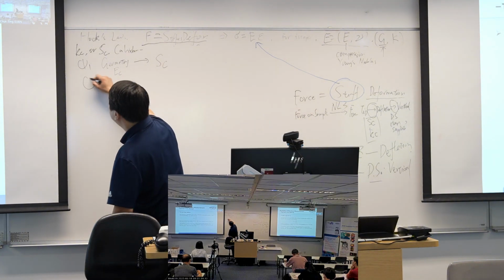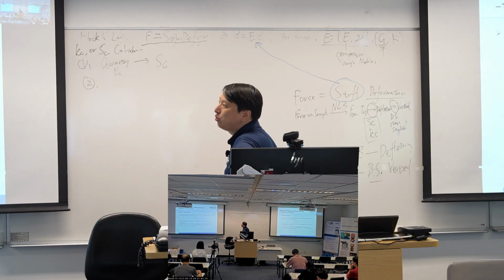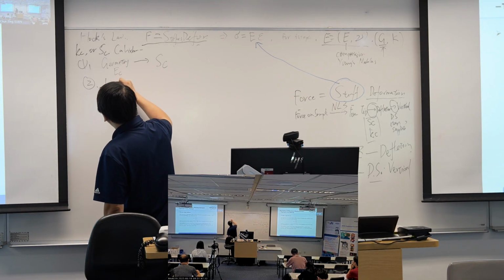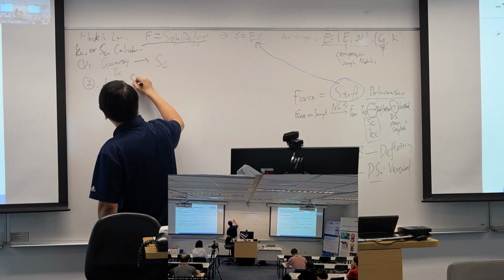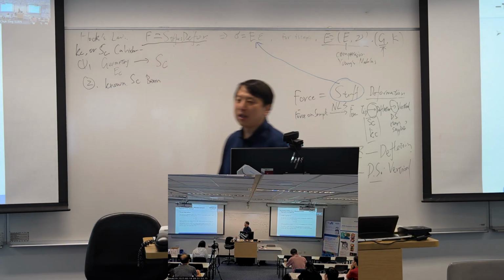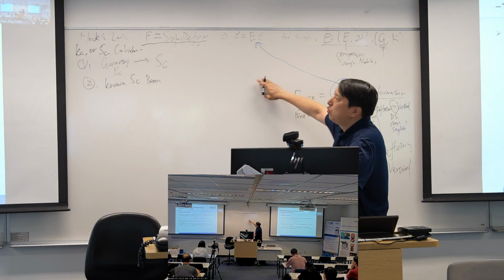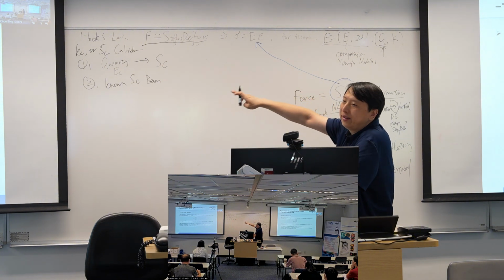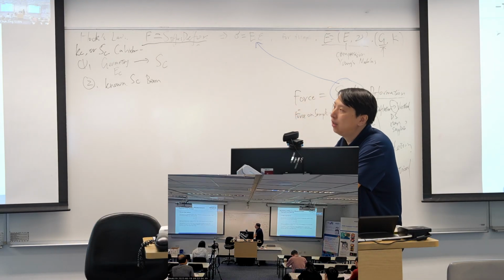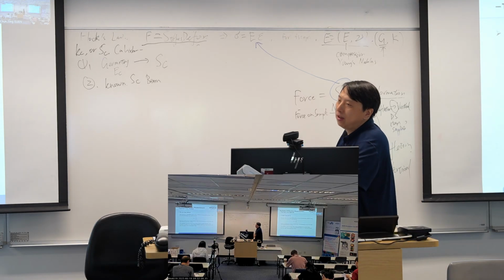And the second, we have a quite super expensive way to do it, which is using a known stiffness beam to do this calibration. Actually, we just do a force curve on this reference cantilever or reference beam, and get the stiffness of our cantilever.